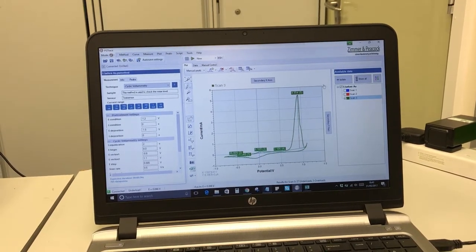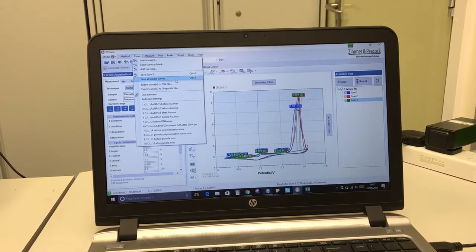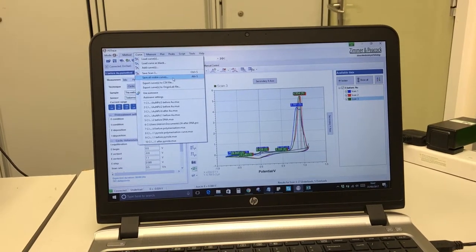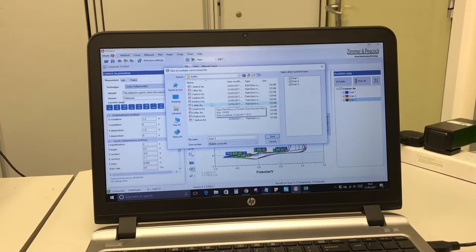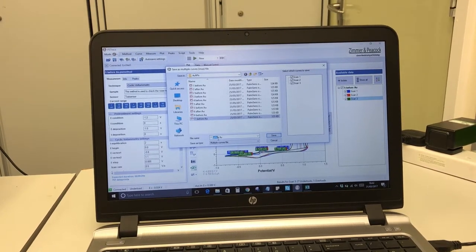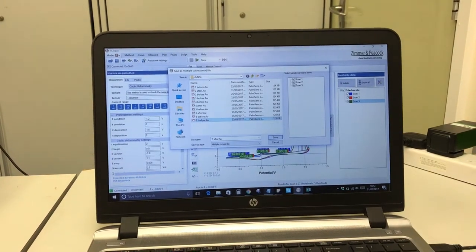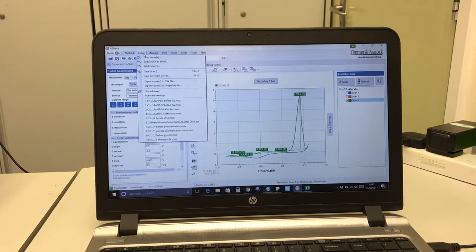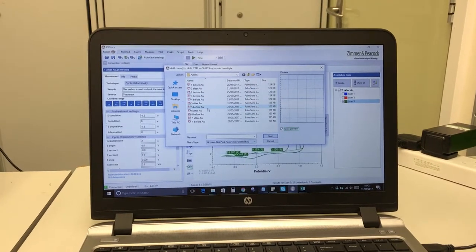And I'm just going to save our curves to make the comparison with the sensors that we have tested previously without the modification. So this is number 7. So I'm saving our curves, so we will take just the last scan so we can upload the other curves to see the difference between modified and unmodified sensor.